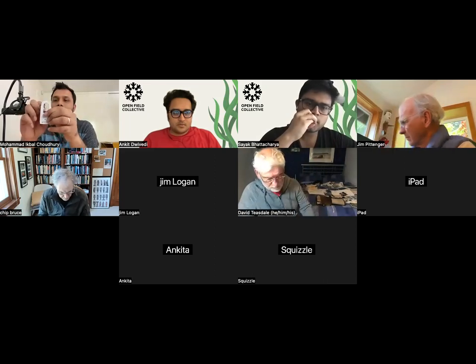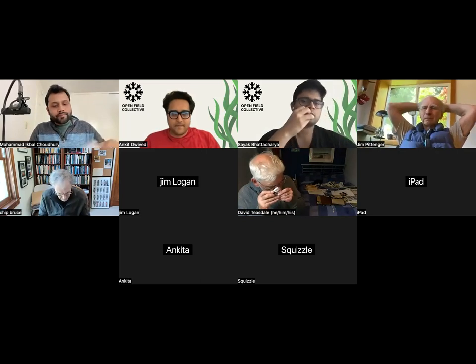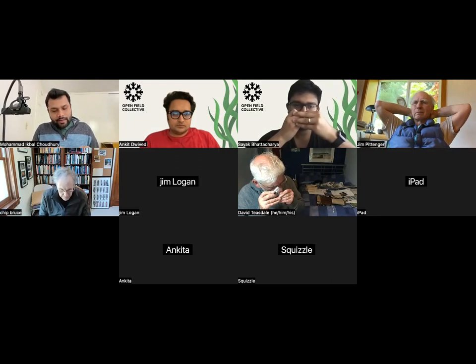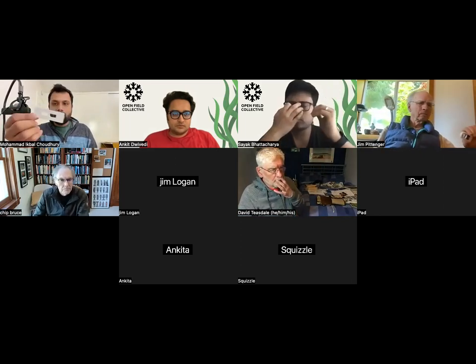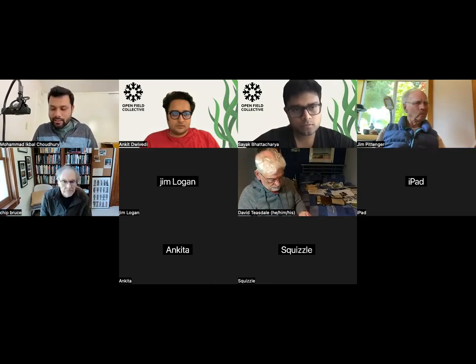It's not very often used for the project we are doing, but if you're looking at insects and stuff like that, it's kind of fun to use that magnifier. They also give you some paper slides that you can use in case you are out of glass slides. I've never used the paper slides, but yeah.